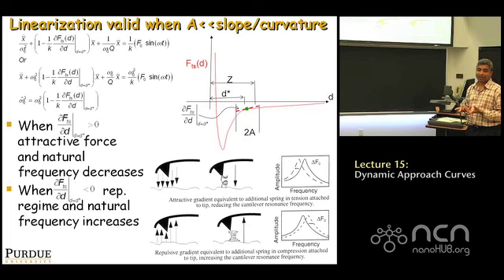That quantity, if you think about it, is a spring, isn't it? So whenever there's a linear gradient, it's like a spring, except what happens is, if you look at the equations of motion, that gradient appears with a negative sign on the left-hand side of the equation, right? So what that means is, whenever partial F partial d is positive, whenever the slope is going up, you actually get a negative, so there's a negative sign there, so you get basically a decrease in frequency, okay?